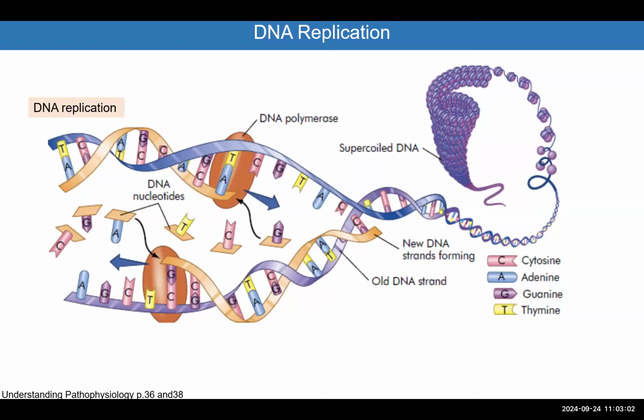So we will use some of the properties of the DNA replication in the PCR. But the difference between doing a PCR in vitro in the lab compared to DNA replication is a couple of things. First, DNA replication is taking place at 37 degrees in our cells. We can play with this in the lab up to any temperature we want. Then the DNA replication takes place all over the chromosome, and in the PCR, we decide the length of the fragment we want to amplify.